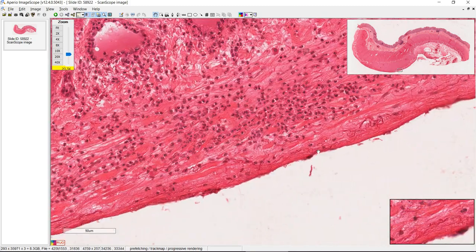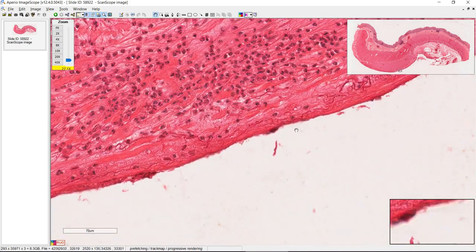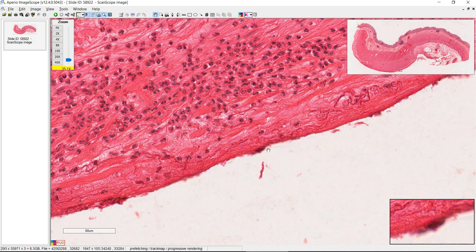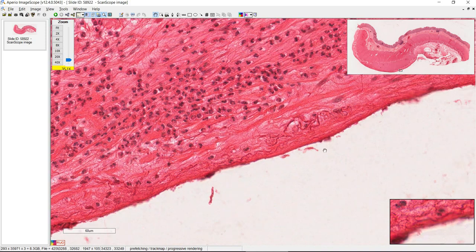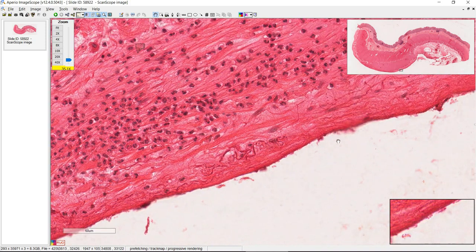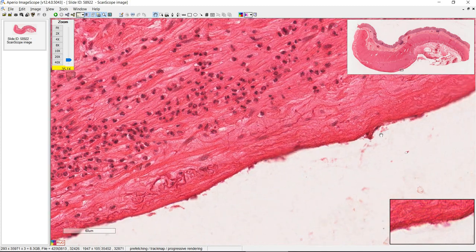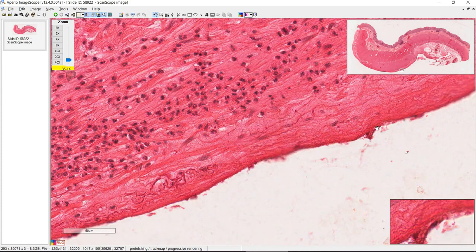If you take a closer look, I think we can see some squamous epithelial cells at the edge of the serosa. So this is the mesothelium.